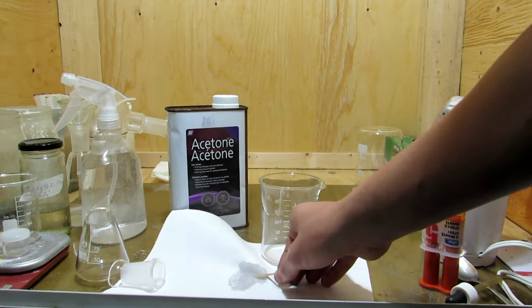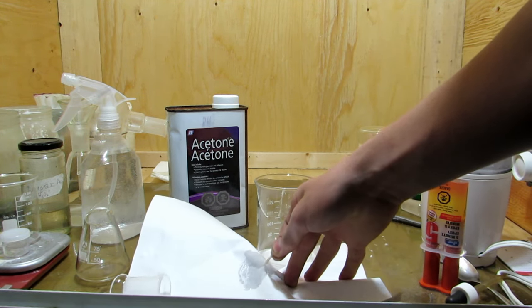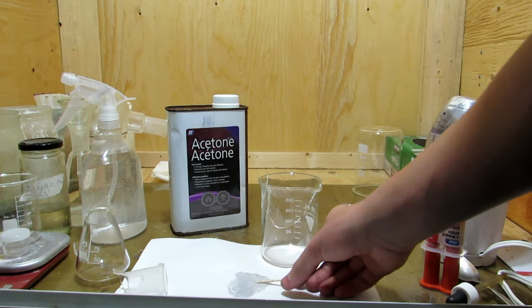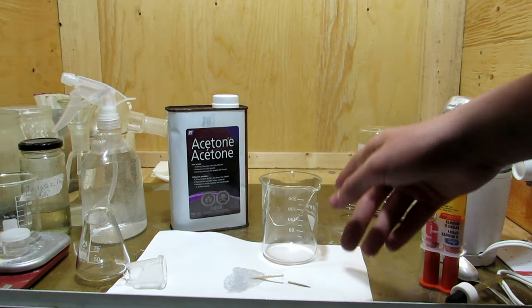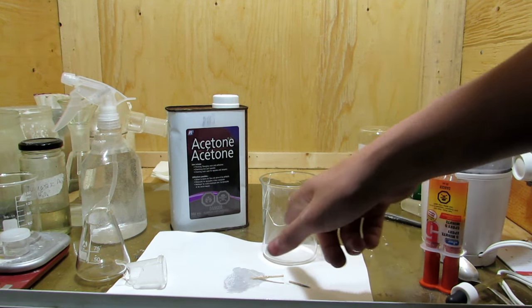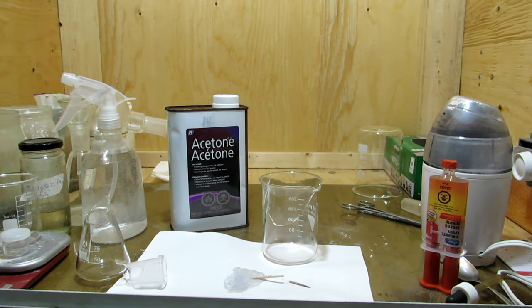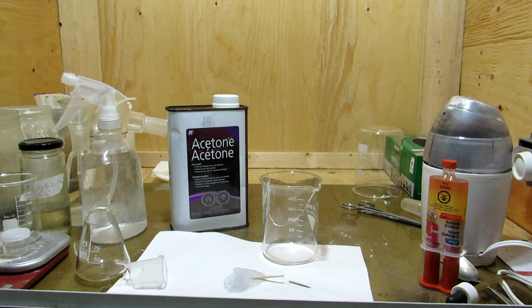A great way to test this is with the epoxy that you already did. This epoxy right here on the paper is very, very hard. This stuff is probably almost ready for us to do the next part. For the next part, we'll squirt out some, apply it all around here, and do the exact same thing. Make sure to push it down so that it stays well, and hold it together for that first five minutes until it sets, and then we can let it fully cure, and then we'll wash away the excess epoxy with the acetone afterwards. So I'll finish up with that, and then I'll meet you back.